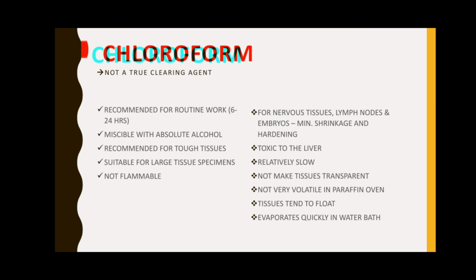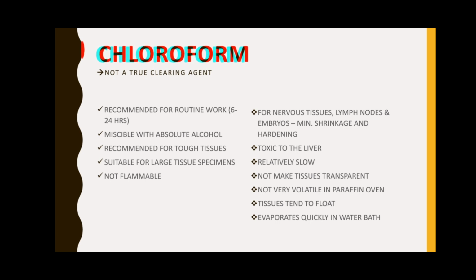As what I have said a while ago, this one is suitable for large tissue specimens and this is not flammable. The disadvantages in using chloroform overpower its advantages, class, because this is relatively toxic to the liver after prolonged inhalation and may be prevented by adequate room ventilation and proper caution when handling the specimen. Wax impregnation after chloroform clearing is relatively slow.